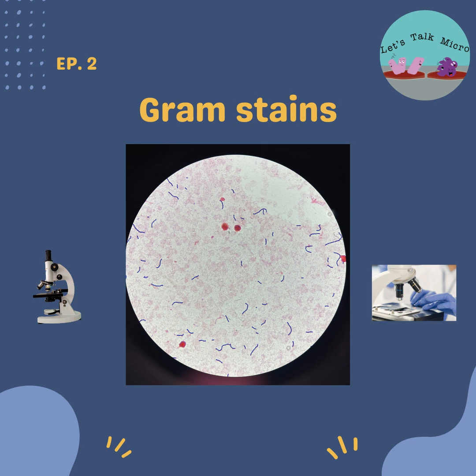I mean, Kocuria is a gram positive cocci. Years ago, it used to be called Micrococcus, but you have to make sure that it is actually a cocci that you are setting on that GP card. And it is very common, and it is all because you actually didn't take the time to do a gram stain. So it's a very important technique. By not doing a gram stain, you release the wrong ID.